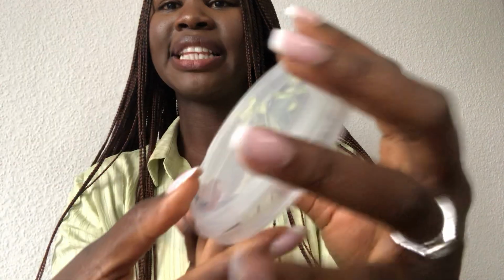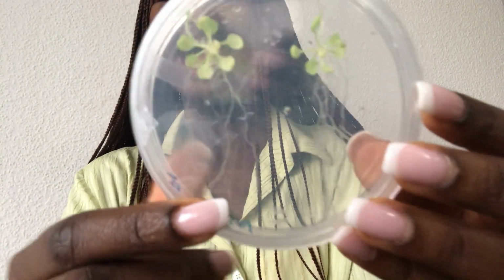So that's another advantage of Arabidopsis, and maybe this is more particular to nematode work, but I would think the anatomy, or the root structure of the plant itself, is actually quite important. I'll show you for instance that this is the root of Arabidopsis thaliana, and you can see that it's quite transparent actually, and this becomes very important when you're trying to do microscopy or cellular work, because then again, I'll give you an example of one experiment we do in our lab.